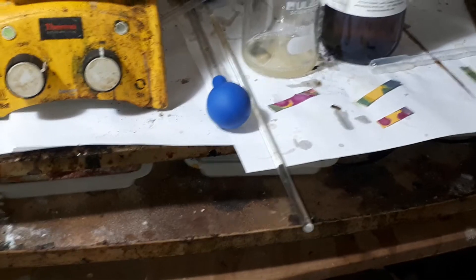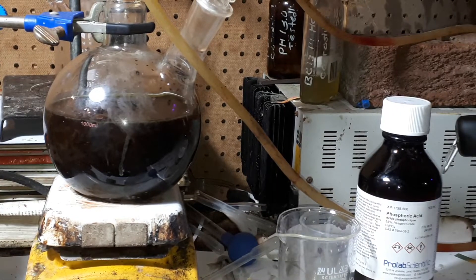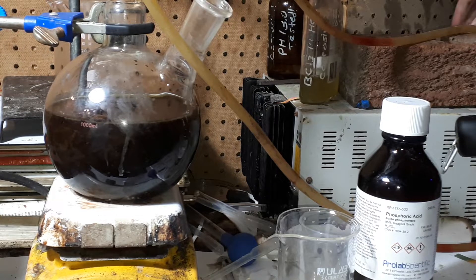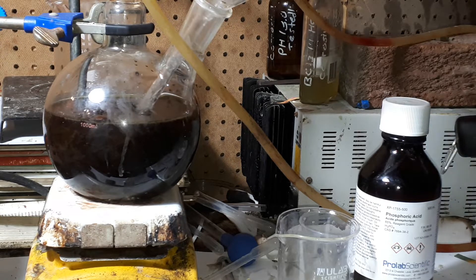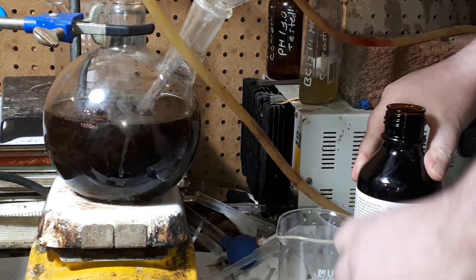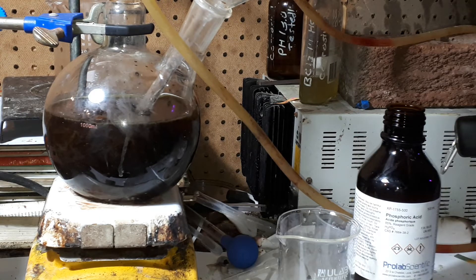You see down there? The pH is around 9, but I have to add more phosphoric acid because it's still too alkaline. A little bit more phosphoric acid. The phosphoric acid is a bit caustic, so you have to be a little bit more prudent with it.